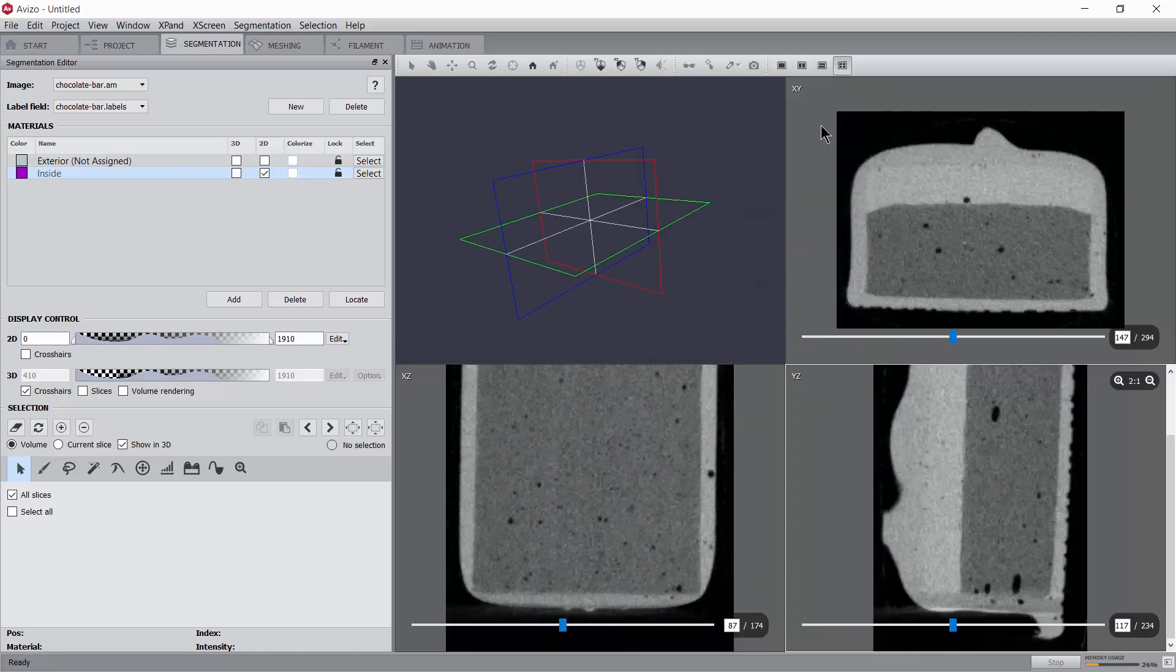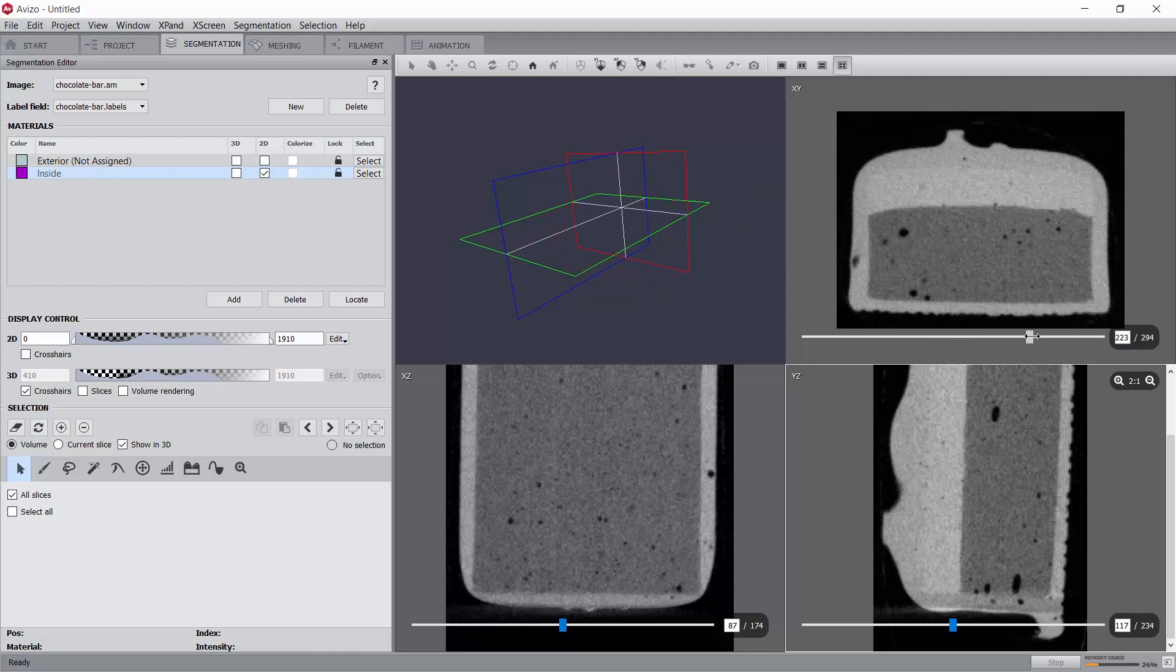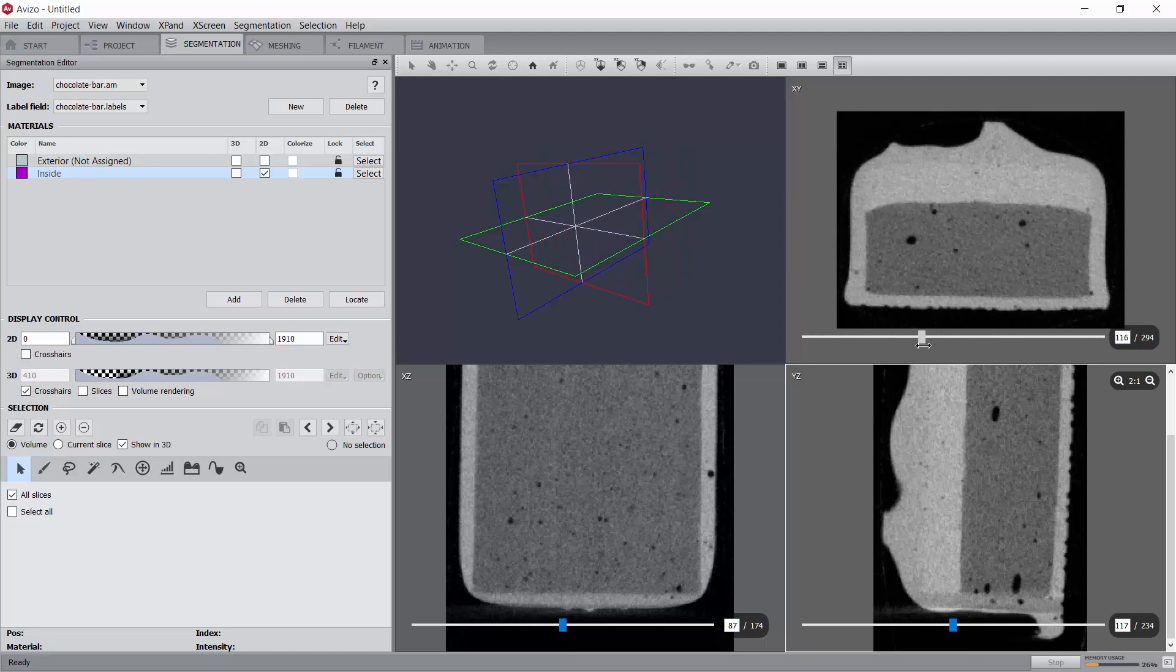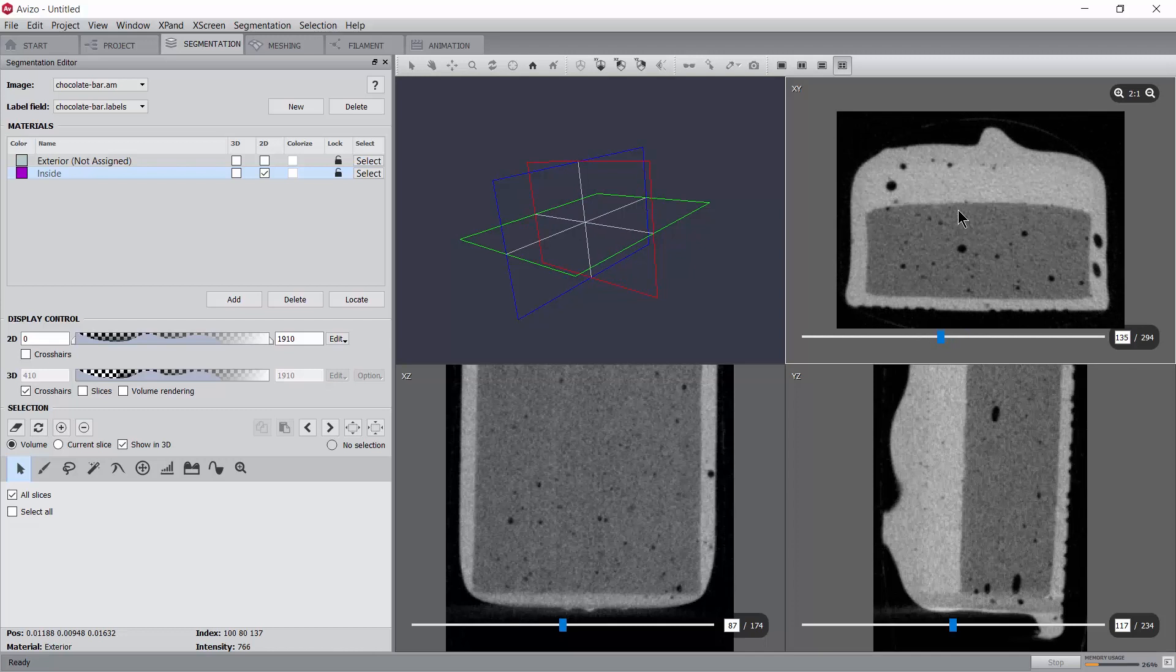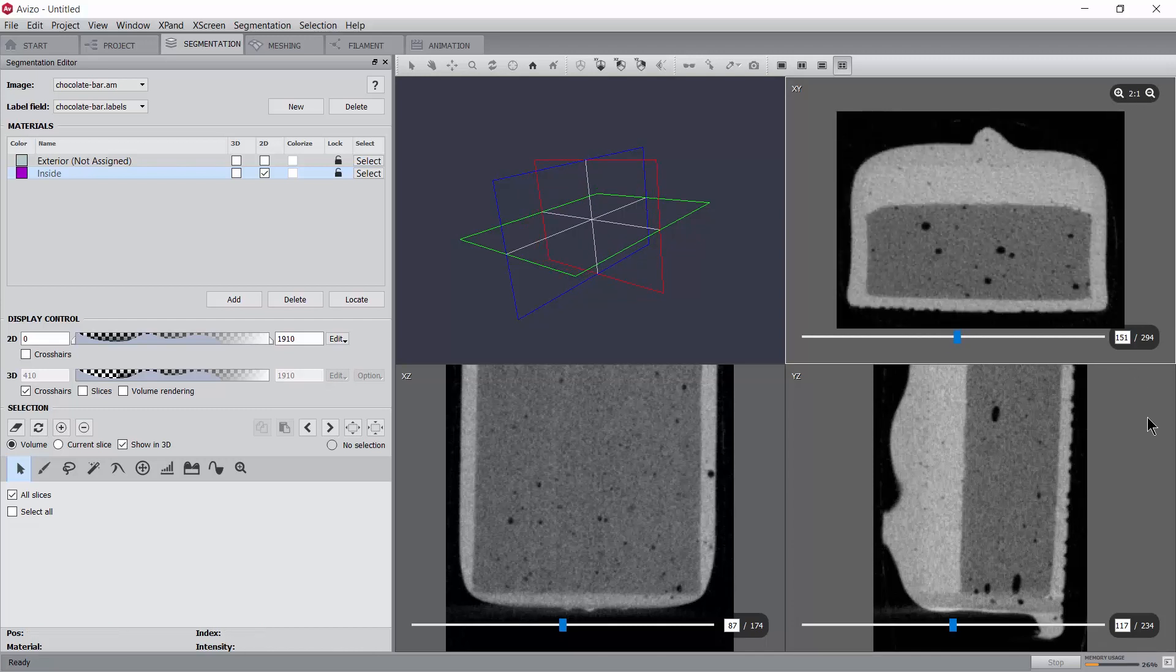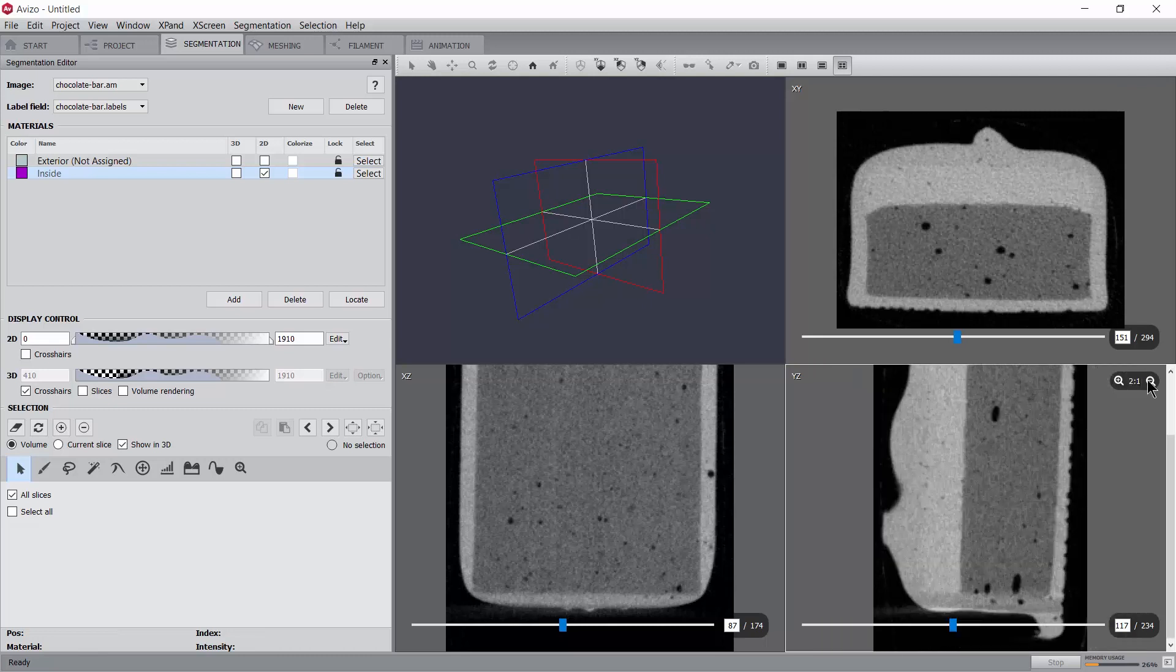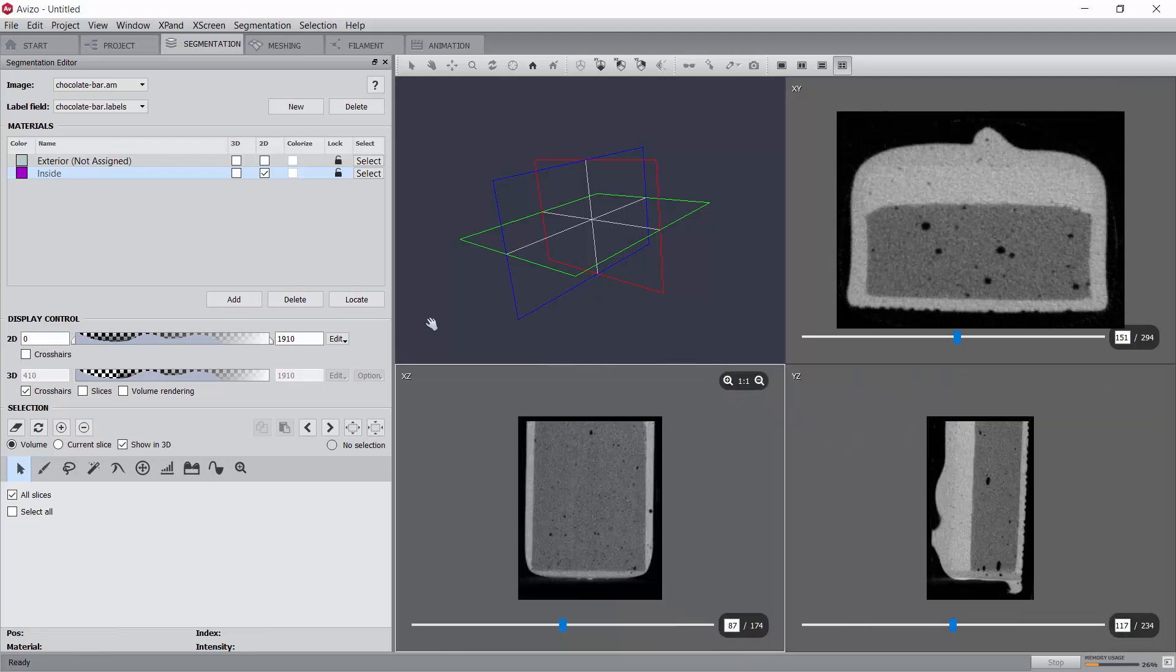In the slice viewers, you can use the slider at the bottom to scroll through the slices or roll the mouse wheel. You can also adjust the zoom for each slice viewer independently directly in the upper right corner of the corresponding viewer. For all viewers, you may adjust the color map using the display control tools.